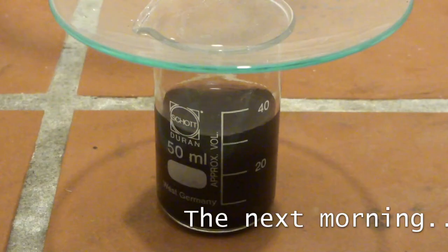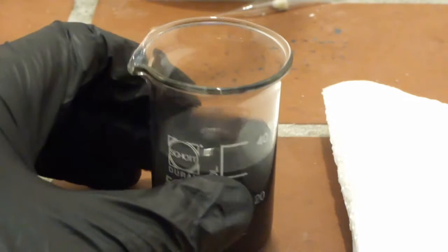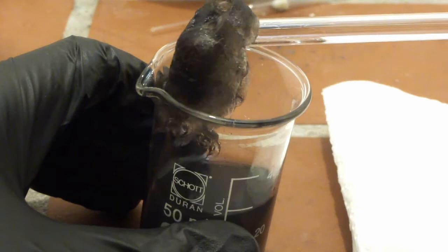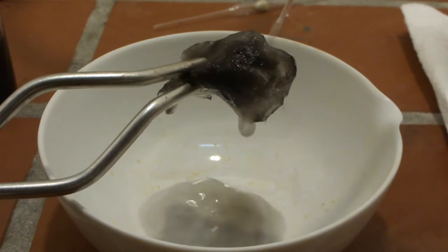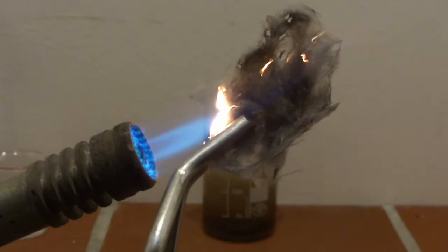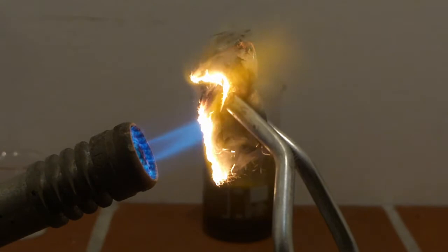The next day, the platinated quartz wool is carefully removed from the solution and rinsed with water. After allowing it to dry, heat it up to red heat for a few seconds, in order to fuse the platinum particles to the quartz wool. And that's it. You have successfully prepared a platinum contact for the Ostwald oxidation.